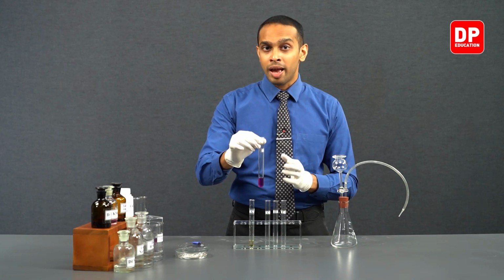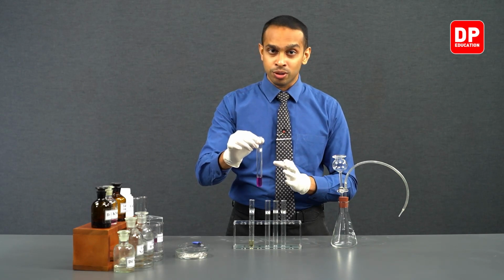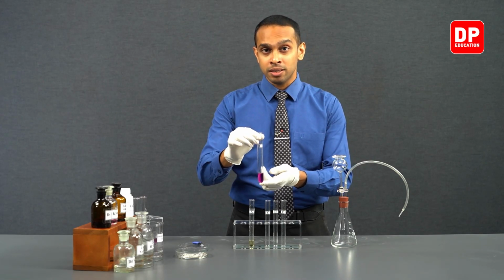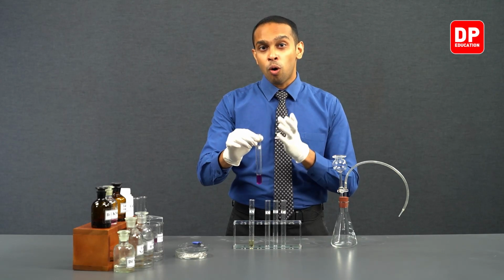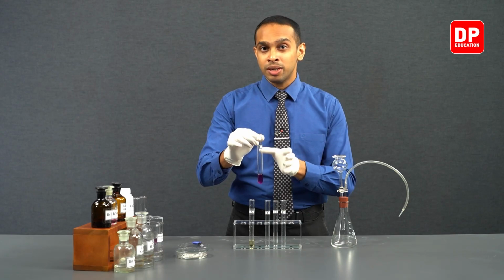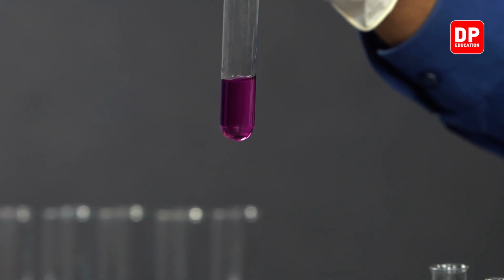As you know, alkenes and alkynes both are unsaturated hydrocarbons, so we can expect the ethyne gas also to change the color of this alkaline potassium permanganate into a brown color.